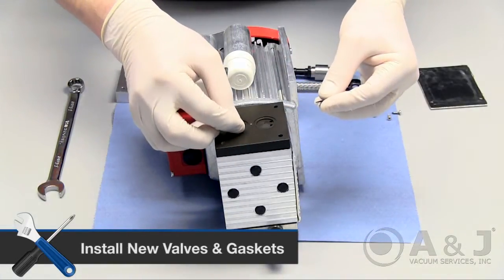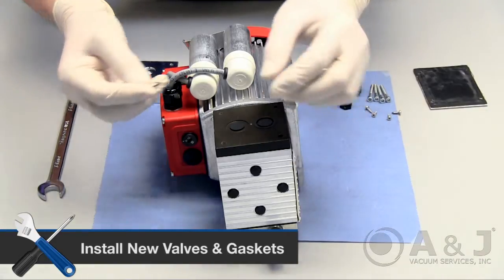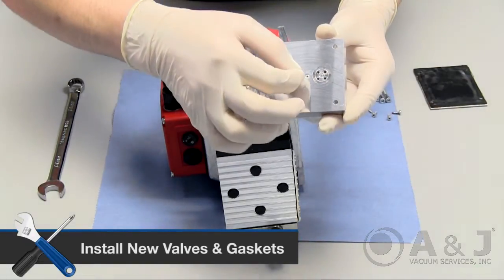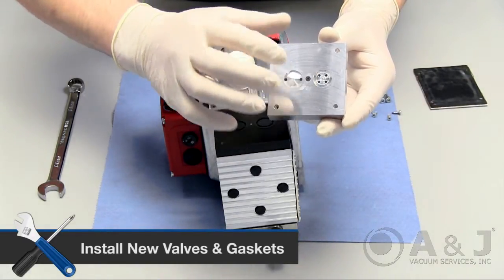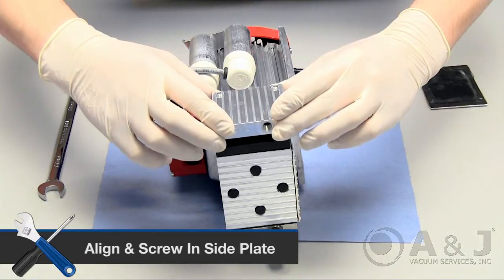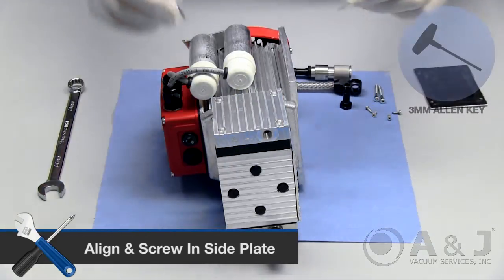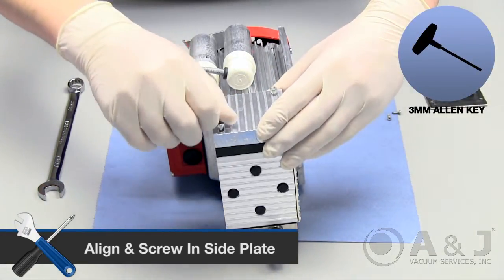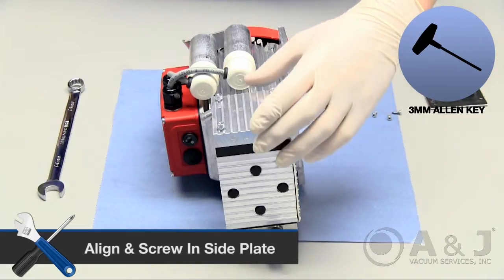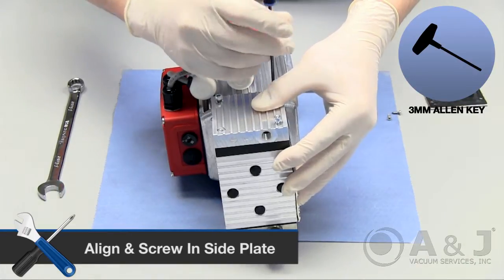Take the two new valves and two new gaskets from the replacement kit and place them on top of the intermediate plate. Be careful to make sure the small gaskets are not slipping out of place when you turn the plate over to screw back into place on the shaft housing. Make sure the plate number corresponds to the same number on the sides to ensure proper orientation and alignment. Screw the plate back into place with a 3mm Allen key. Screw opposite diagonal screws to ensure properly distributed tension.